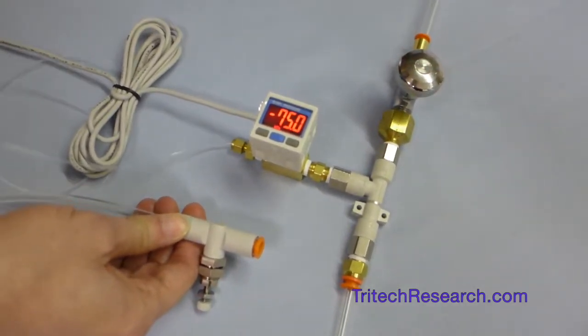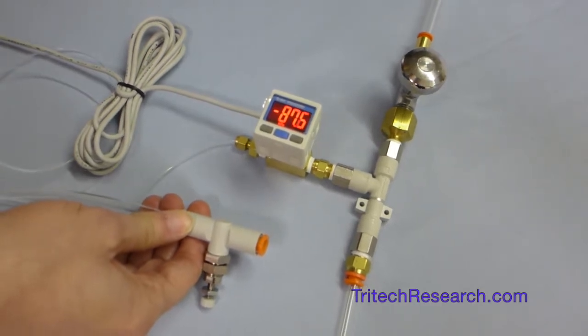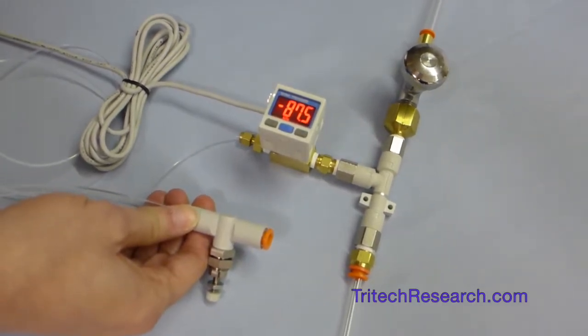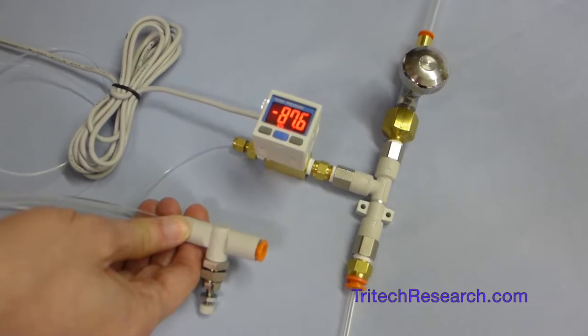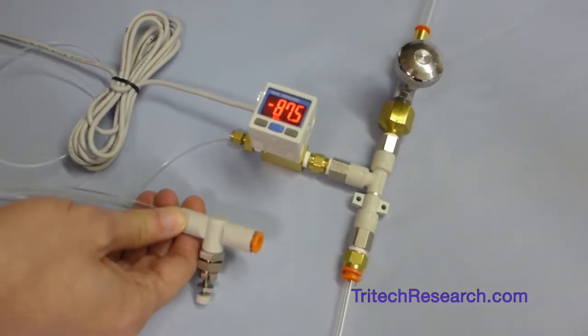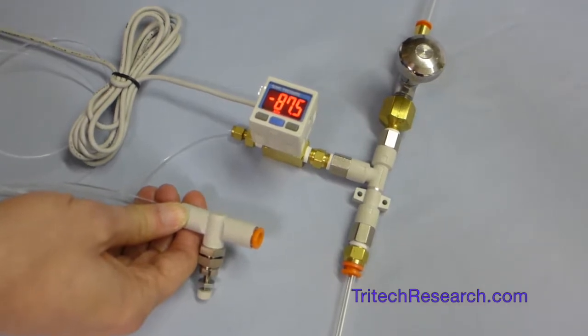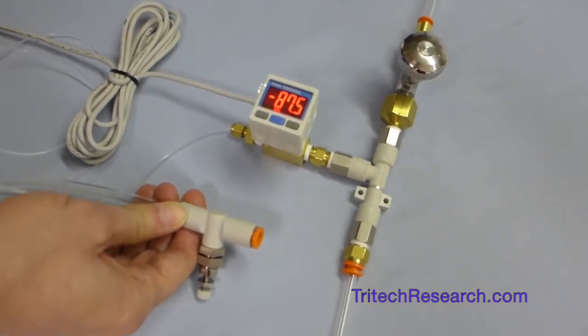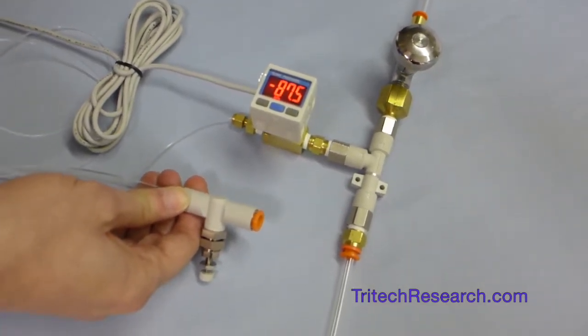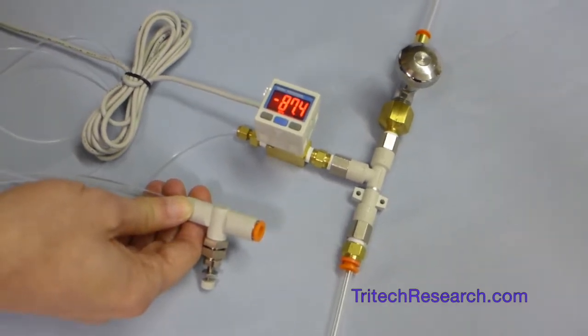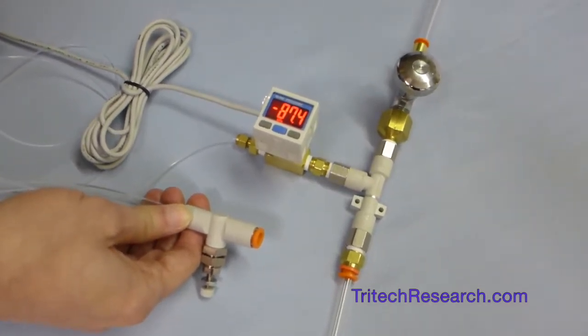So when the system is closed at the other end you can see that we're getting around minus 87 kPa. So that's a little bit better than minus 12 psi out of a possible minus 14, which would be a perfect vacuum between 14 and 15.